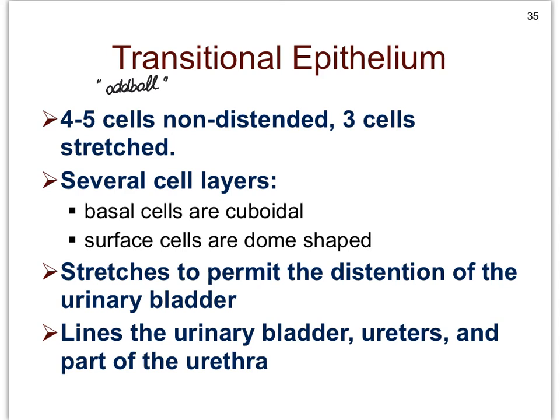Why is it called transitional? It has the ability of going from multiple cell layers — four, five, six — to three layers or even less when the organ is stretched. We find it in the lining of the bladder and the ureters — the tubes that leave the kidneys and dump urine into the bladder — and a bit in the urethra, particularly where the bladder gives rise to the urethra. If we have our two kidneys each giving rise to a ureter, here's our bladder, and then arising from the bladder in the male much longer than in the female, we have the urethra. So we have transitional epithelium lining the ureters, the bladder, and a portion of the urethra.